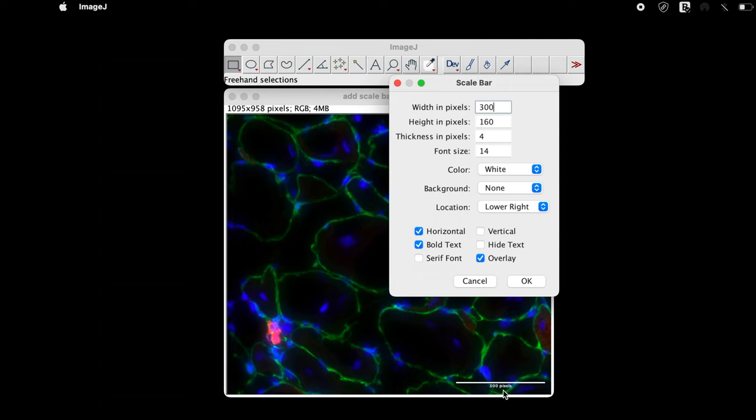The next parameter is height in pixels. Let us change to 200. We will check the change in the height in pixels in the later part of the video.